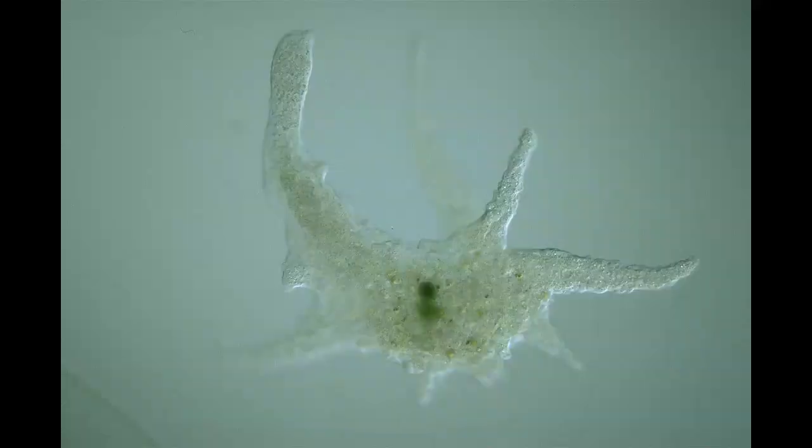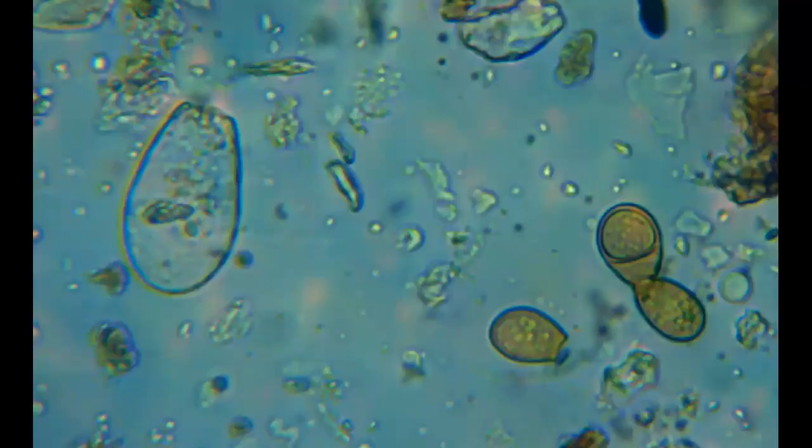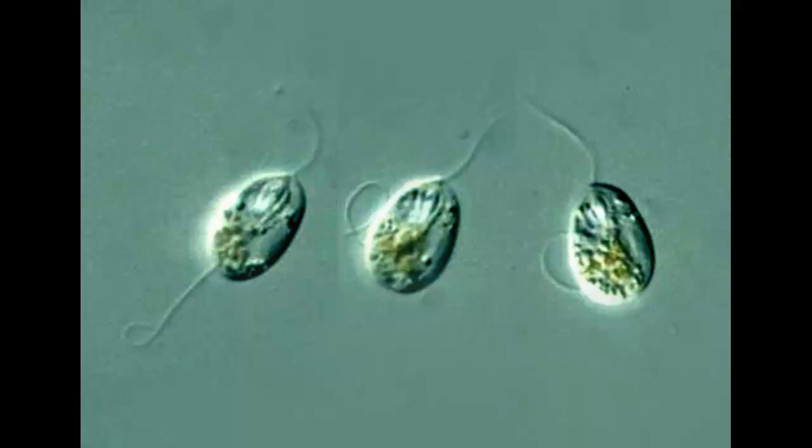The next thing to look out for are the protozoa. Protozoa can be one of three groups: amoebas, flagellates, and ciliates. Amoebas can come in different forms — they just look like a big blob, moving very slowly and putting out little arms every which way. You can also have a testate amoeba, which is an amoeba inside a shell. A flagellate is a one-celled organism that has what looks like little whips coming out of it — one, two, sometimes up to four — called flagella, which they use to move. They move in a jerky manner and are usually on the smaller side.